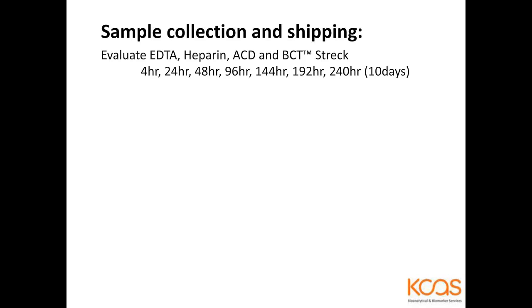All right, so that allows the cell to be stabilized, but it also introduces a new point of contingency, which is that my antibody must recognize not only fresh epitopes or fresh markers on the cell surface, but fixed markers, in order for the side-by-side comparison of a fresh epitope to a fixed epitope. And those can change over time.